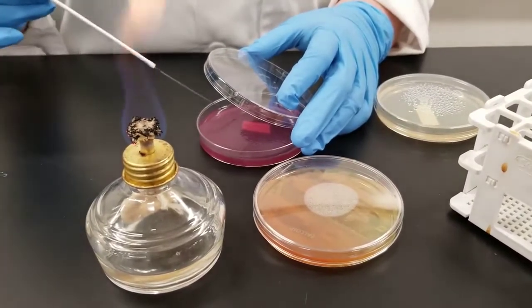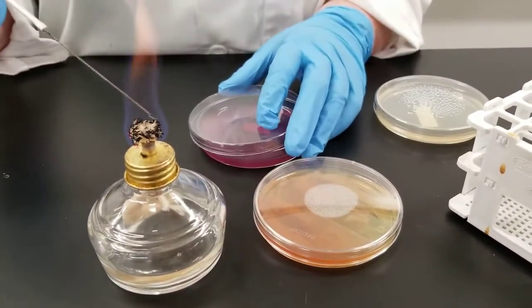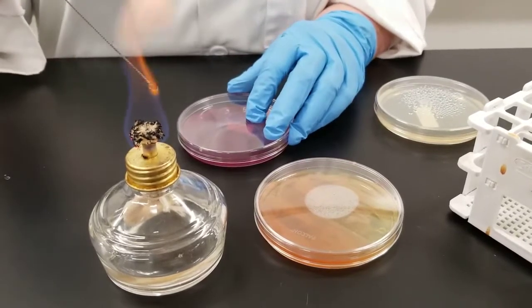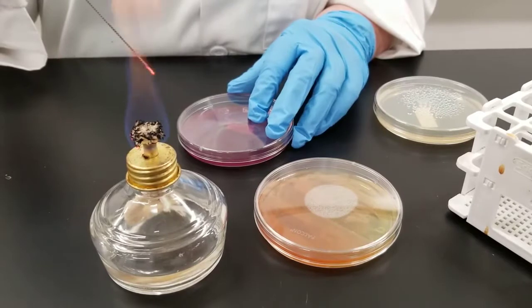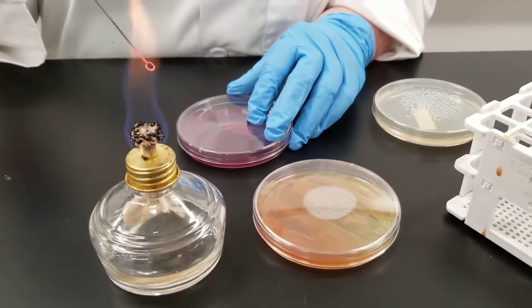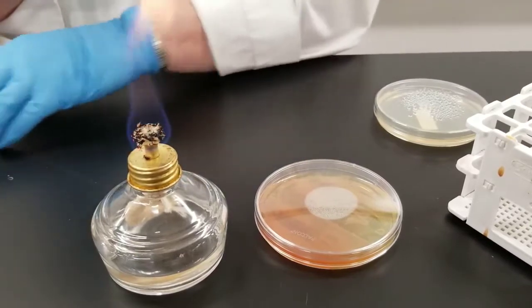Try not to dig the loop into the media. That's a learned thing — I do it often by feel. When you're done, you need to flame your loop again. You still have bacteria on there, so you need to sterilize it. Get it nice and glowing. This plate is done now.